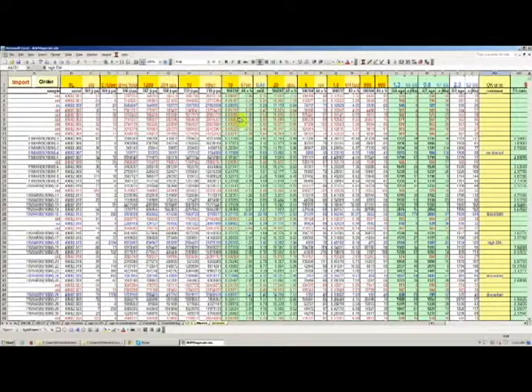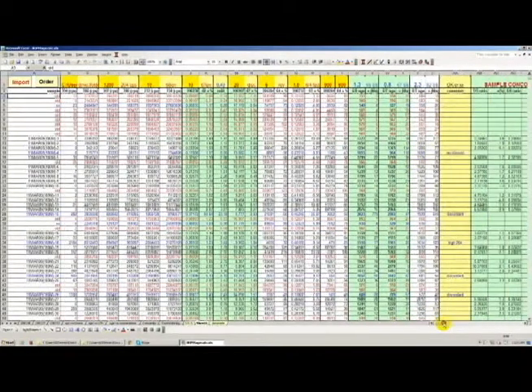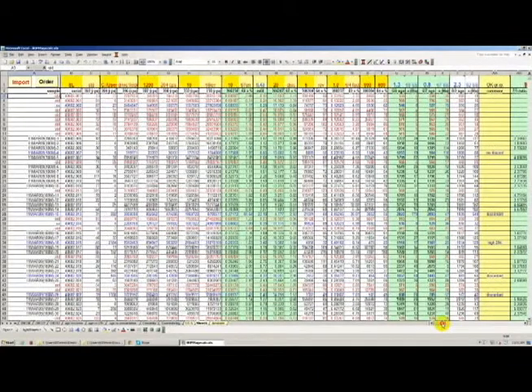So this was a good run. Okay, so I want to hit order again, so everything's fresh, and now our data is basically ready to be exported to a data table.